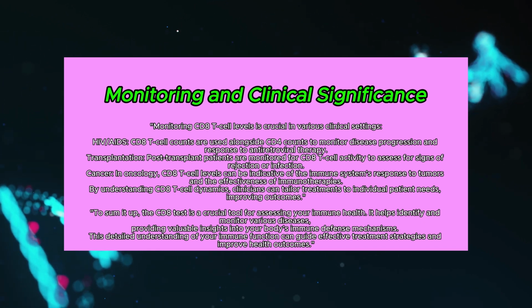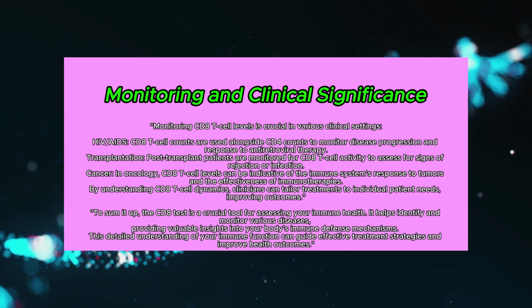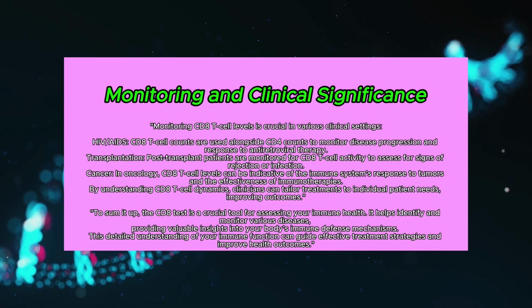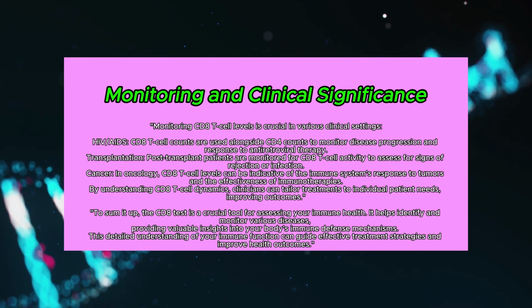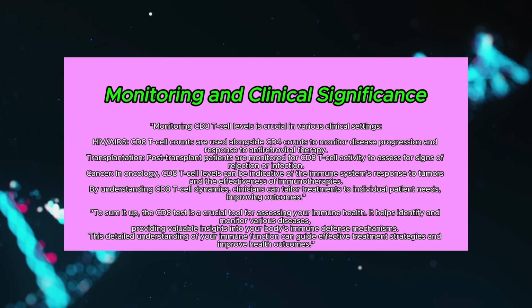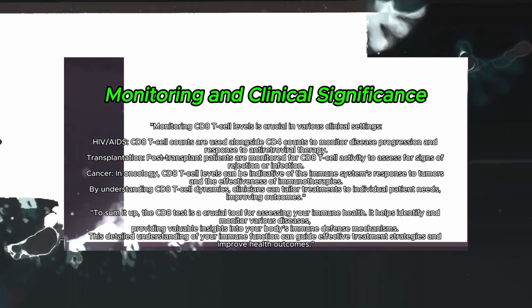To sum it up, the CD8 test is a crucial tool for assessing your immune health. It helps identify and monitor various diseases, providing valuable insights into your body's immune defense mechanisms. This detailed understanding of your immune function can guide effective treatment strategies and improve health outcomes.